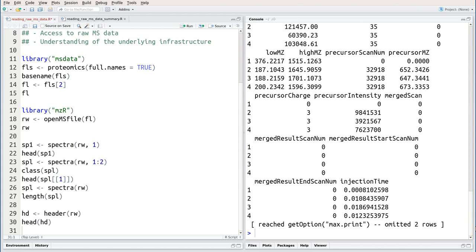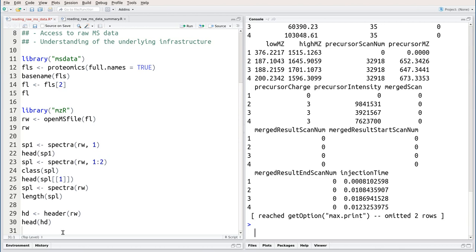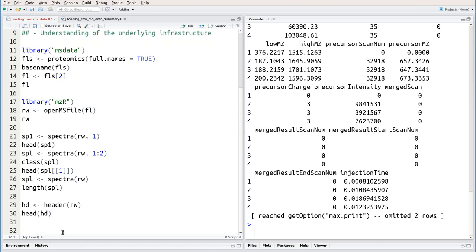So OpenMS file, spectra, and header allow us to access the individual pieces of information, but one by one. This leads us to the third package that we're going to use in this session, which is MSNBase.